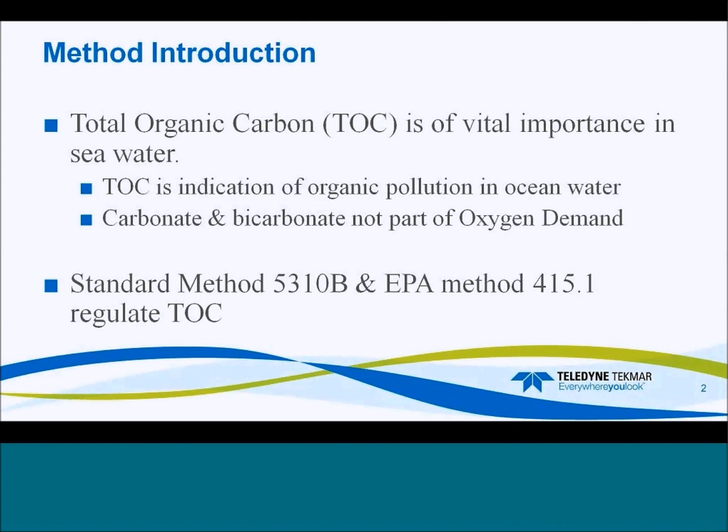For this process, it's required that the inorganic carbon is removed, and that's your carbonates and your bicarbonates, because that's not part of the oxygen demand. I'm going to start with talking a little bit about 5310B, and then I will get into 415.1, and then we will talk about the actual salt samples that I analyzed for this presentation.